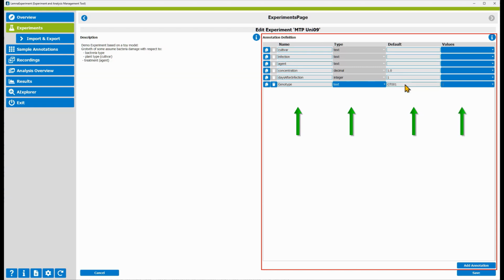and optionally you may define a list of allowed values. These values are entered by typing them into the menu title and press return. They will then disappear and be an option in the menu. If you define values in this list, then only these values are allowed in the annotations for this column. Otherwise, all values allowed for the type of the column are allowed in the annotations.